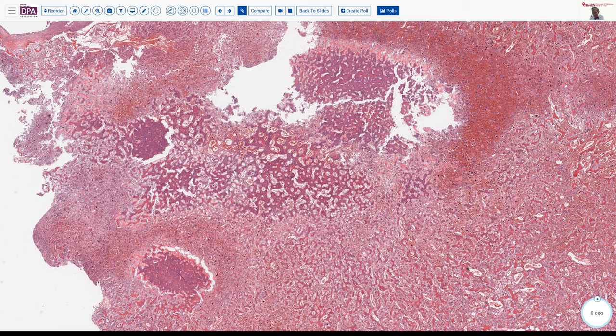and it is something that takes a longer time period, but is much more gentle with the antigens that you're trying to expose. Now, if you're using formic acid and you preserve your antigens, that's accomplishing your purpose. But you're right that it does take much longer with these more gentle methods to leach out the calcium and to make it malleable to cut. So that's the disadvantage.